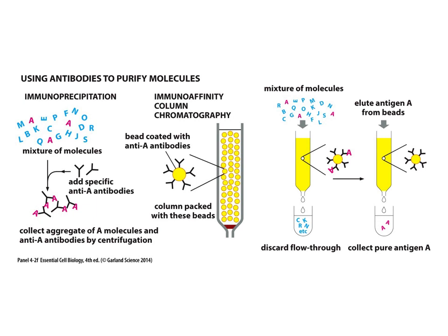When we add the homogenate, all the other molecules, all the other proteins are going to be able to pass through, but the antibodies are going to catch all of them. So in this example, the antibodies are going to catch all the A's, so all the other letters are allowed to pass through.